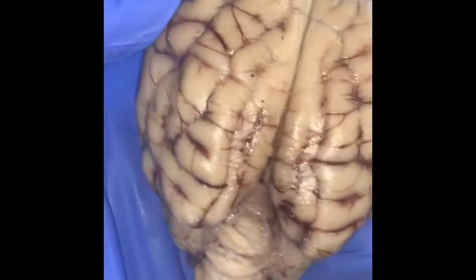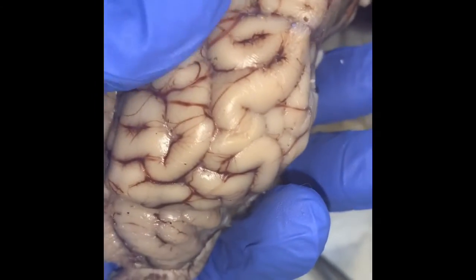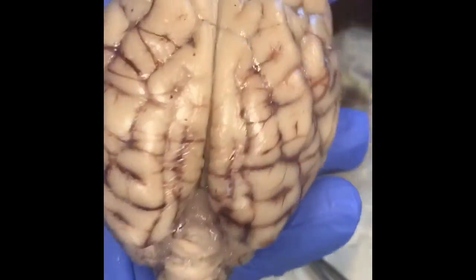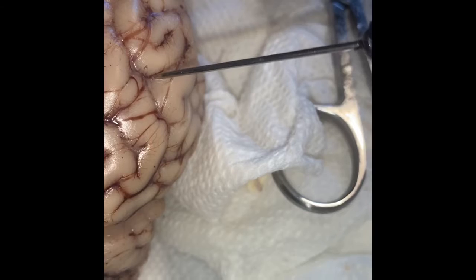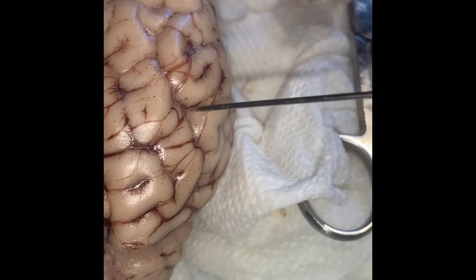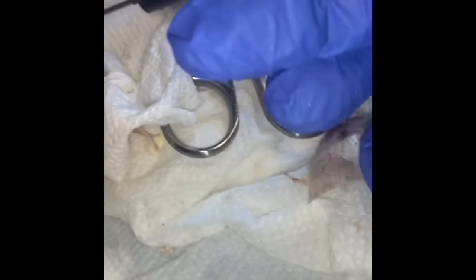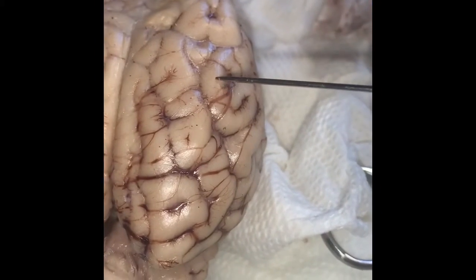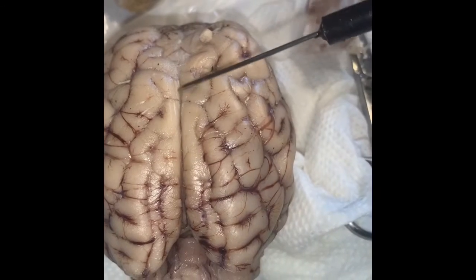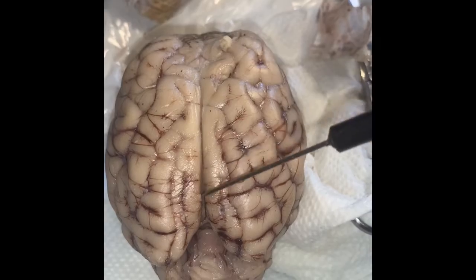Mentioned before, but the innermost layer, the shiny layer on the sheep brain, that is the pia mater. So going in here, we have the sulcus or sulci, and right in here, and then we have the bigger ones, which are the gyri. Last but not least, straight down this line, this is our longitudinal fissure.